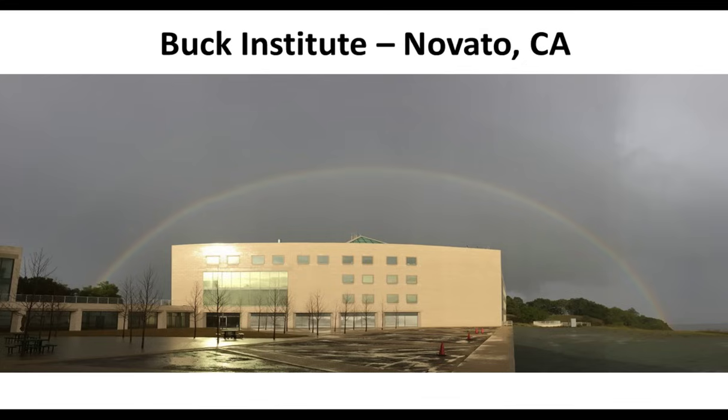Yeah, and I'll just interject here as well. One of the cool things about doing the PTM scan in a serum or plasma sample is what we've found and published on, that it obviates the need for depletion kits or depletion columns for that serum. You can directly take that serum. A problem with serum is the abundant proteins, things like albumin and the other 20 abundant proteins. You can take that sample and just do, say, an acetyllysine enrichment or a methylarginine enrichment. Now you don't have to deplete before, and you're getting a real good look at even lower abundance proteins in that serum by doing the enrichment.